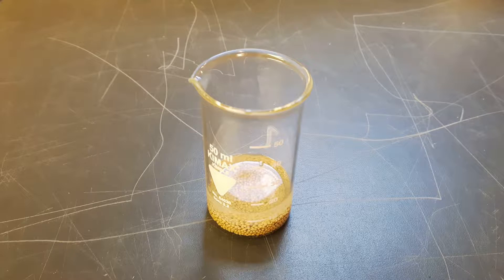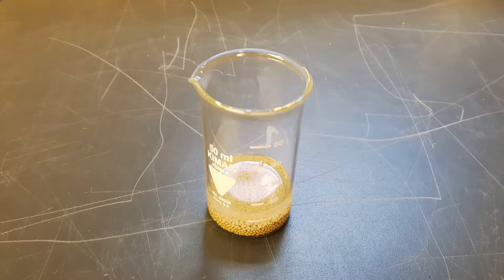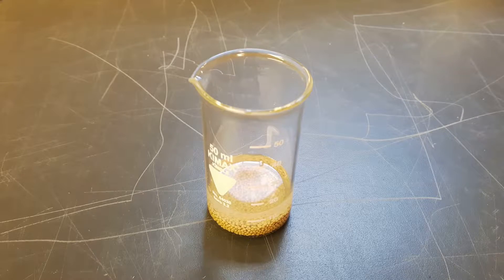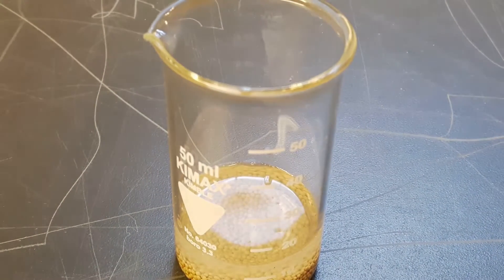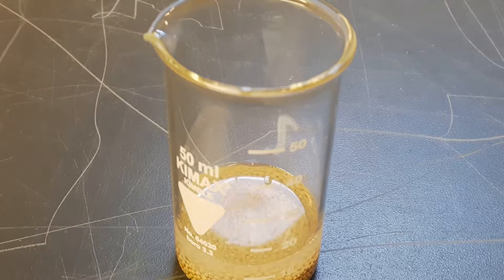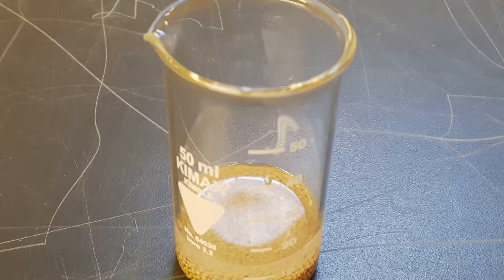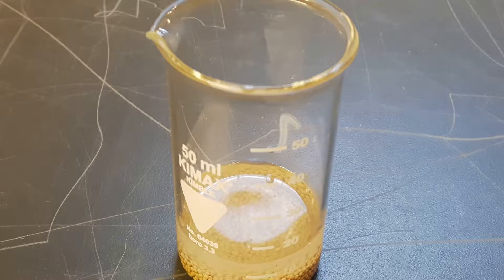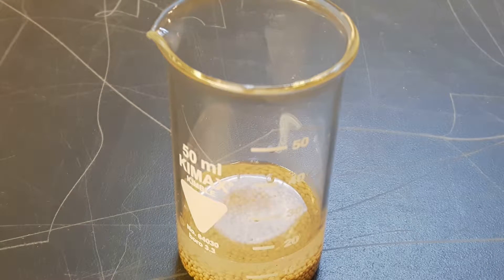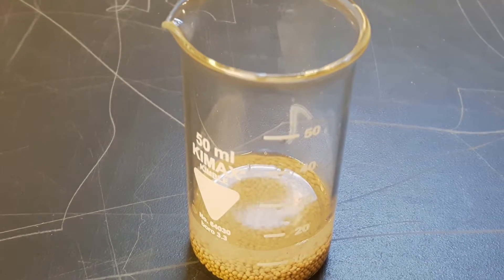And the molecular sieves are like very tiny folds, and they are so small that only water can go into these little balls, and the acetic acid molecule is too big to fit into the little holes on the surface.